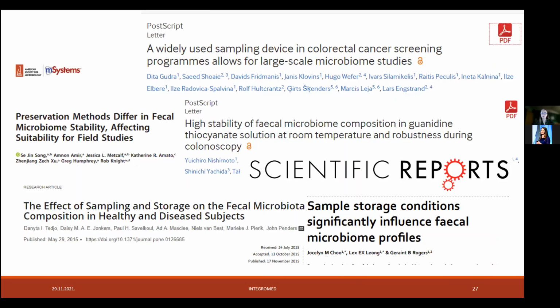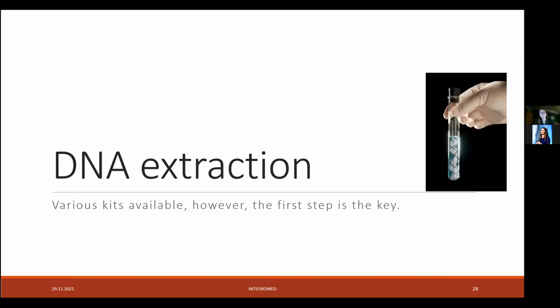And of course, if you are not sure, you can do small benchmarking studies before doing the large study, for example, collect some experimental samples yourselves and evaluate some storage conditions and so on. So next, shortly, I will also talk about DNA extraction.